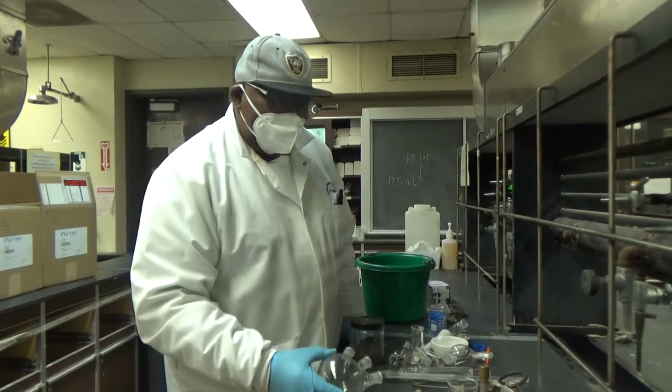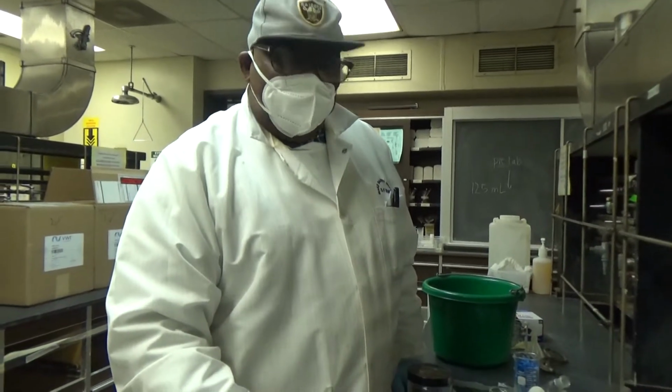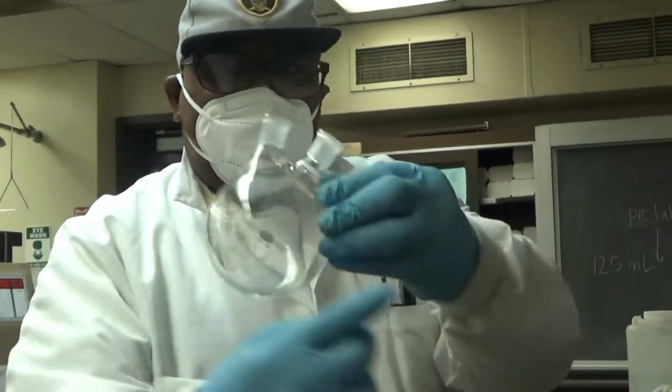Today we are going to speak about steam distillation. First thing we need to know is the glassware we'll be using. We'll be using a 3-neck round bottom flask. 3 necks: 1, 2, 3, round bottom flask.